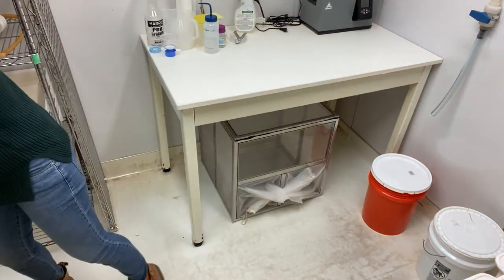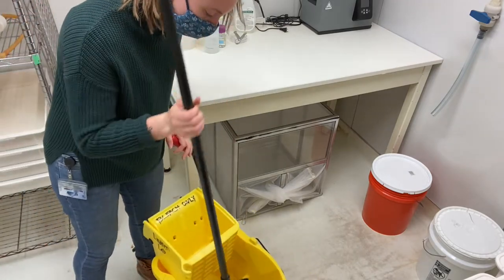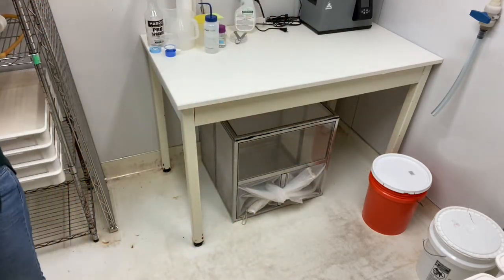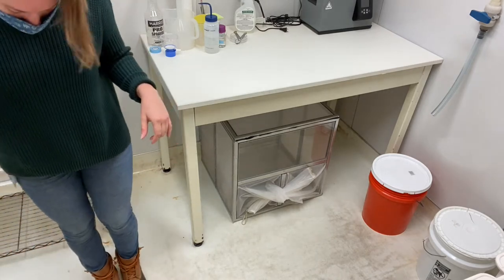Now that we're back in the confiron, put the mop in the bucket. I just make sure the top is fully soaked in the bleach water, wring it out well, and then I mop the first half of the confiron — up to this line right here on the floor.